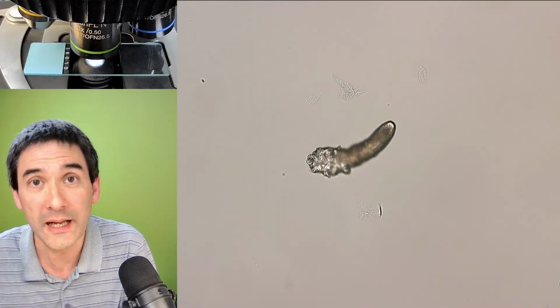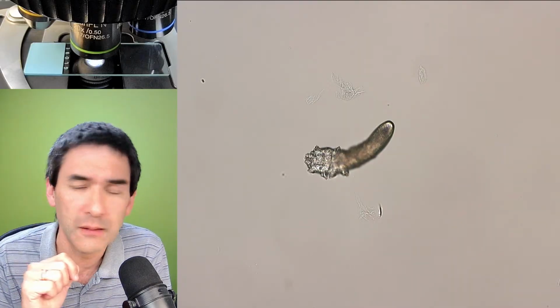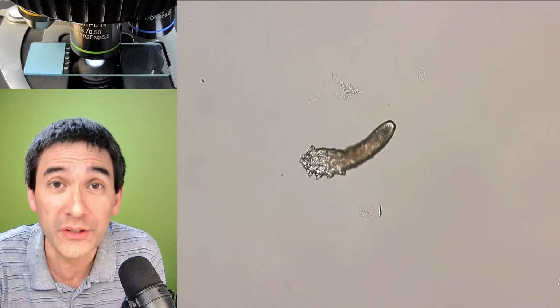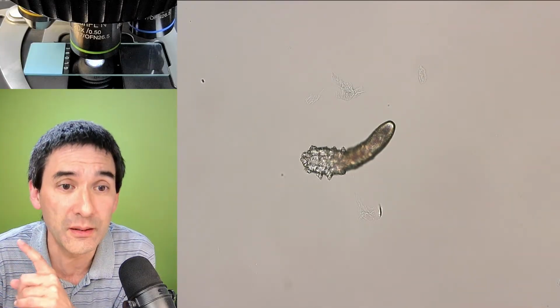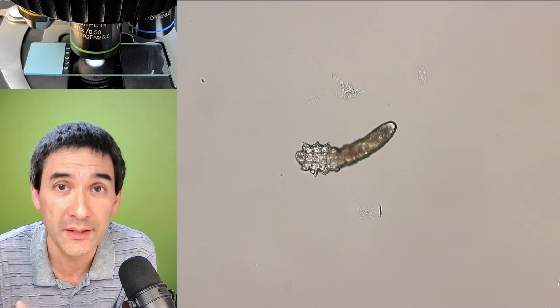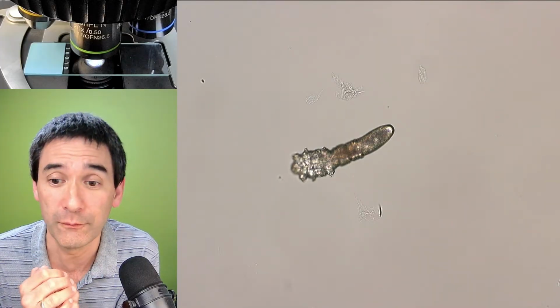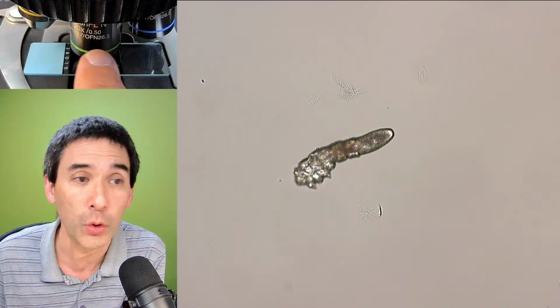The question you might ask is, can we not make it a little bit larger, this one over here? As you can see, I'm using my 20 times objective, and I said not yet, because there is no cover glass on here yet. I'm going to be adding one later, because the face mite is in a drop of oil, and because I needed access to it with a pipette, there's no cover glass on top, and therefore I cannot go up with the magnification further, for safety reasons. So what magnification is that? I'm using now my 20 times objective.